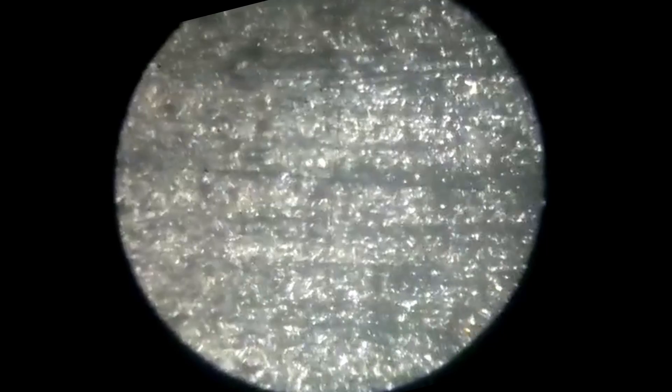You can see the repetitive nature of clay and silt size quartz. By observing thin section of shale under the plain polarized light, you can see shale shows its fine grained nature with clay and quartz minerals. Dark spots represent organic or iron rich materials.